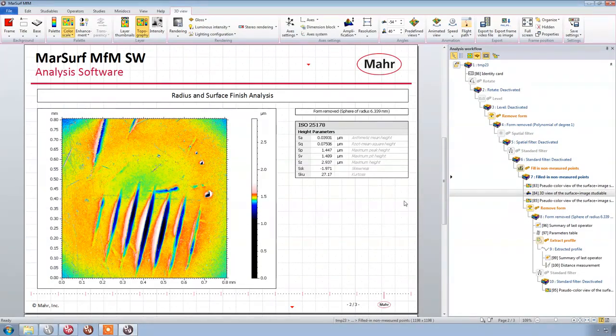And the other thing I've done here is I've calculated the 3D roughness. And again, SASQ, similar to RARQ. I was expecting an SA down in the single-digit nanometer range from this part. Obviously, we're not there. A lot of that has to do with these relatively large-looking check marks on the surface, which are roughening up the surface quite a bit.